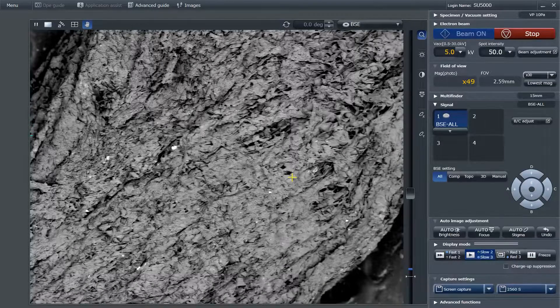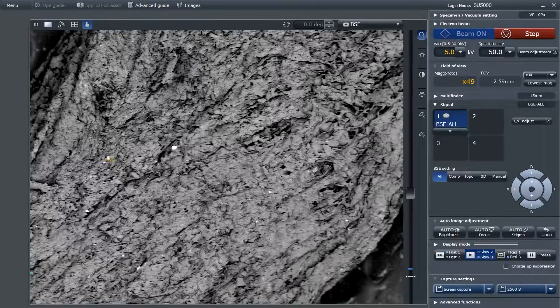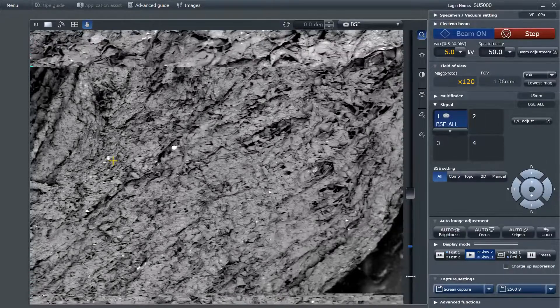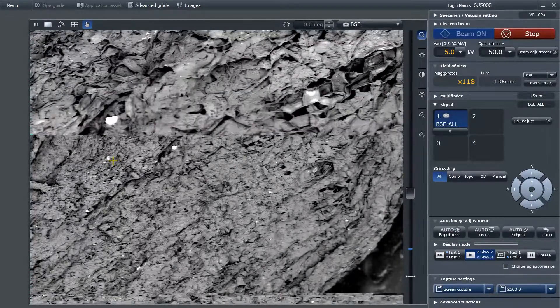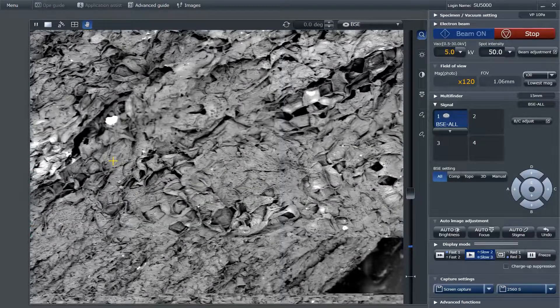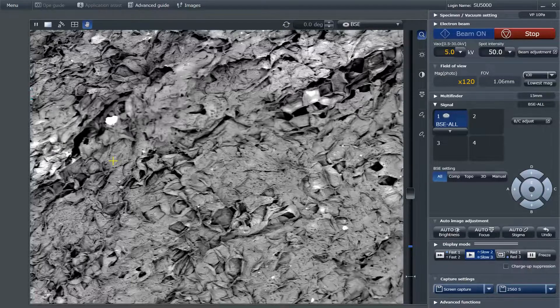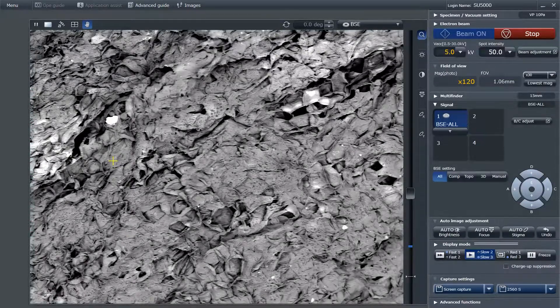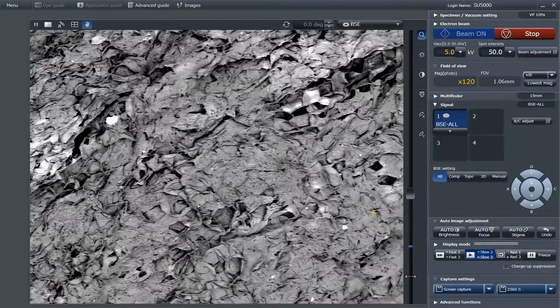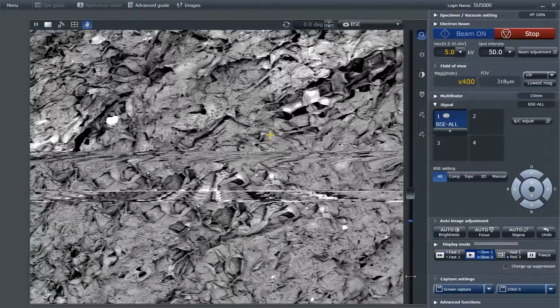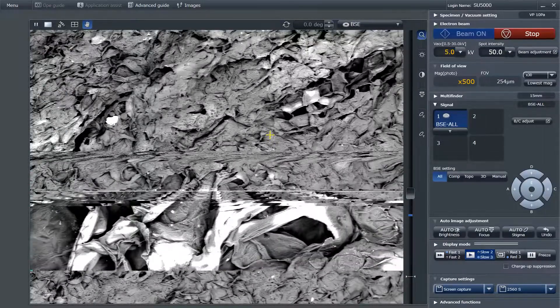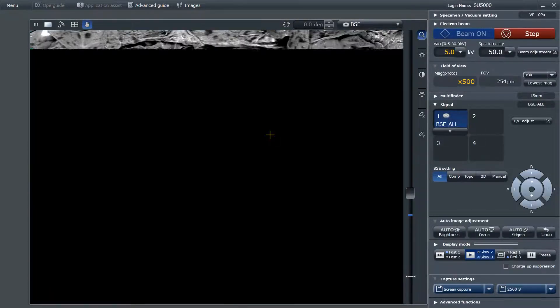Here's a good, well-focused image of the surface of the carrot. And you'll also begin to notice some of those small black dots appear on the surface if you look hard enough. They become more evident here.